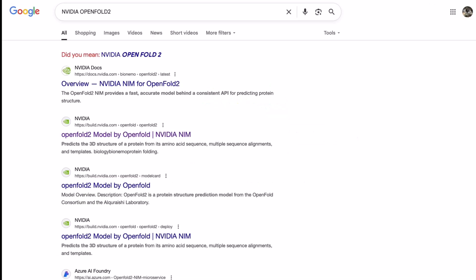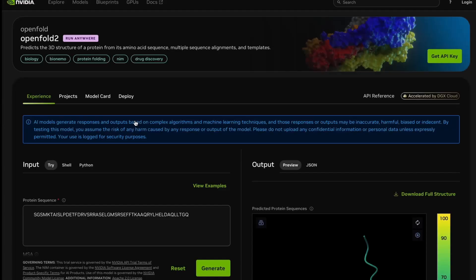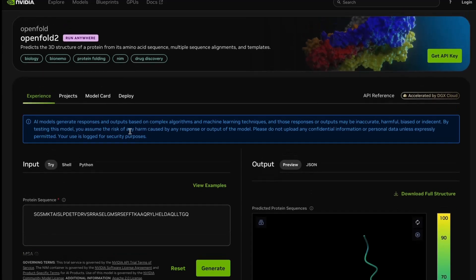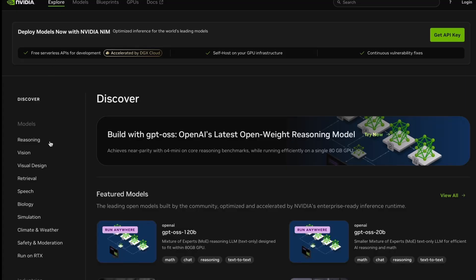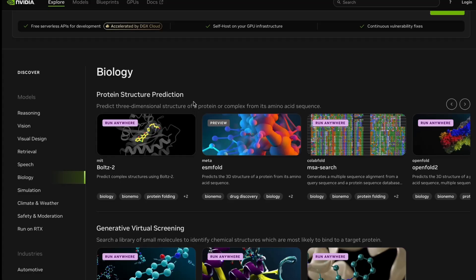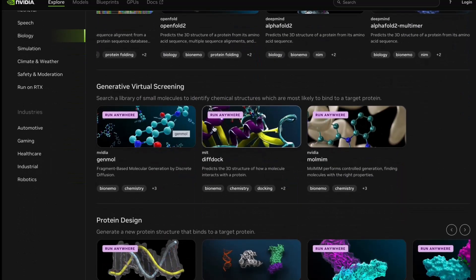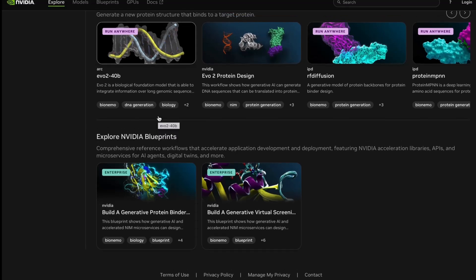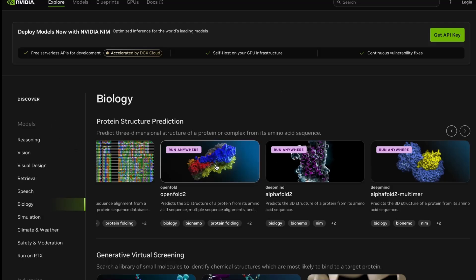Once we hit search, the second option is OpenFold 2 model using this NVIDIA-based server. I will also show you how to navigate through all the different tools. It is not that in this particular server you can only do protein modeling — you can also do docking and multiple other things. If you go to Explore and then Biology, you can see in the biology section there is protein structure modeling with many tools available. There is also generative virtual screening and protein designing, and in generative virtual screening you have docking tools as well.